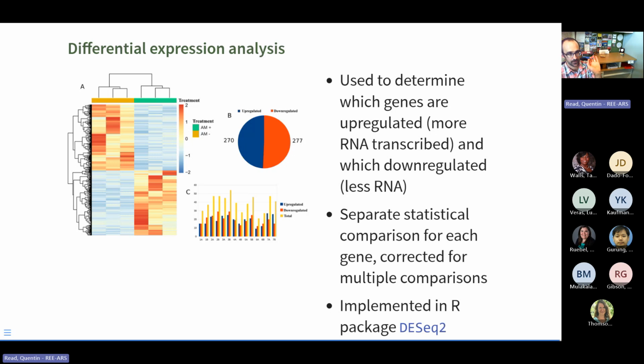So this differential expression analysis is basically looking at each feature in isolation. It is not looking at patterns of variation across the entire data set. It's almost like a t-test for every gene or every metabolite separately.